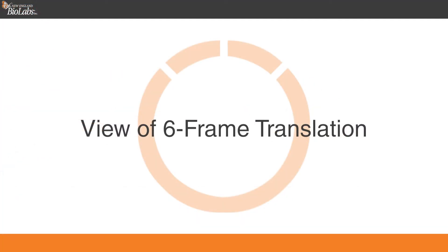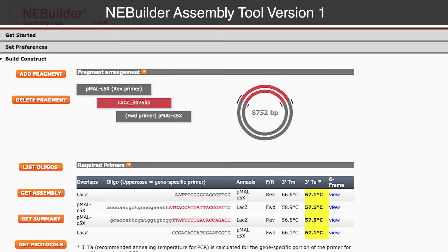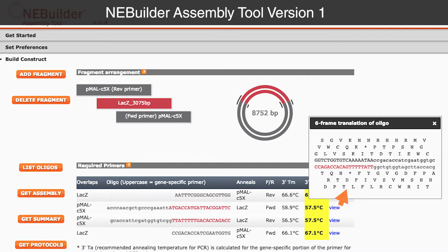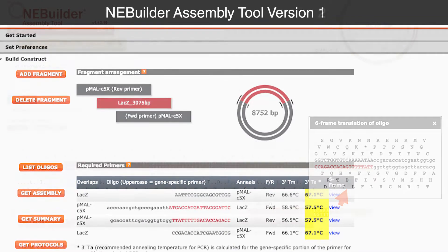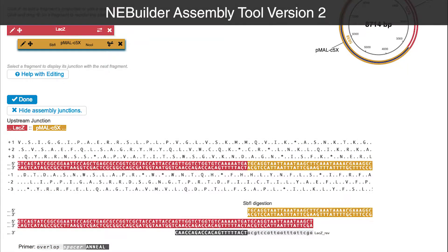View of six-frame translation. Another major change is how the six-frame translation at a junction is viewed. In version 1, this view was accessed from the list of required primers. In version 2, junction details are viewed by selecting a fragment. In addition to the six-frame translation, the new detail view displays the overlaps that were used to create the assembled junction.